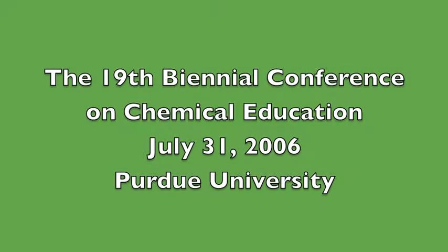As one independent variable is changing, the volume of added sulfuric acid, 3 dependent variables are changing, all in different ways. And the student who really understands electrolyte solutions can understand everything. I presented this demonstration at a major national conference just as I do in the classroom. Try your hand on all the votes. I'll bet you don't get them all right.